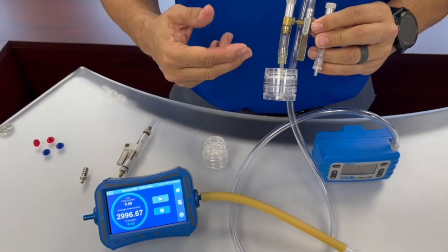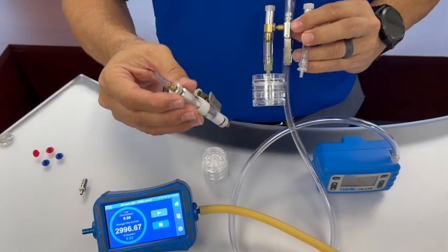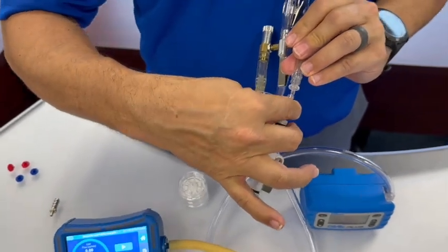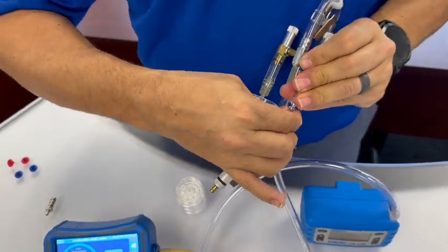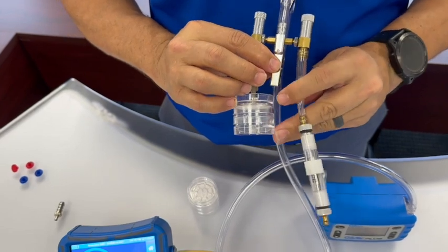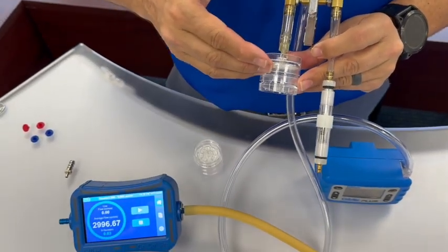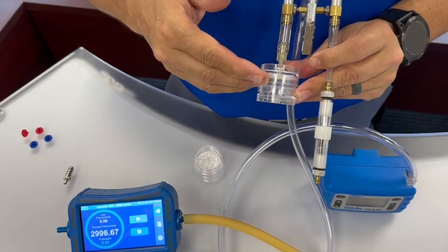As an alternative to the two-cassette setup, we can also set it up with a sorbent tube and sorbent tube holder. You would connect the sorbent tube holder to the inlet side of the manifold, and again you would follow the same instructions — calibrate the first cassette to your flow rate first.